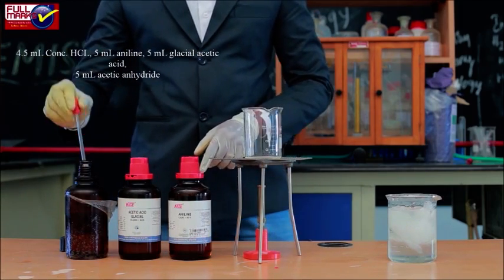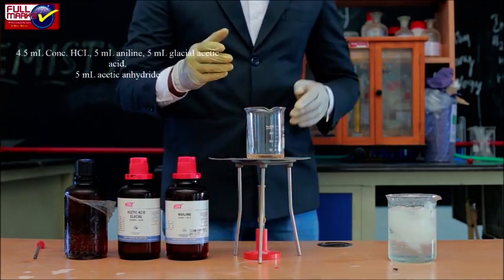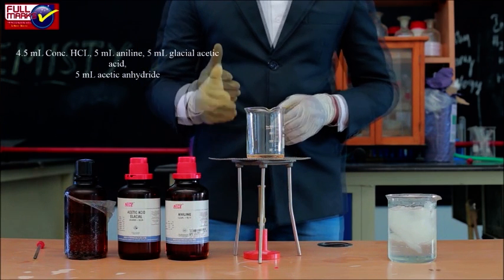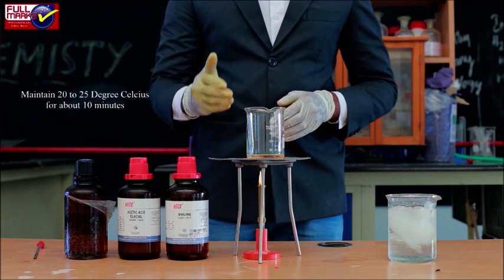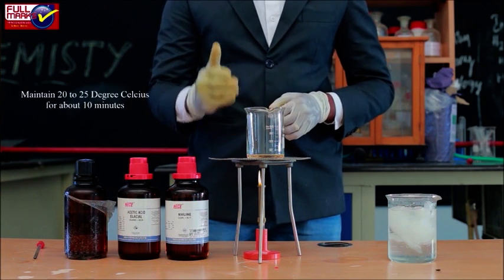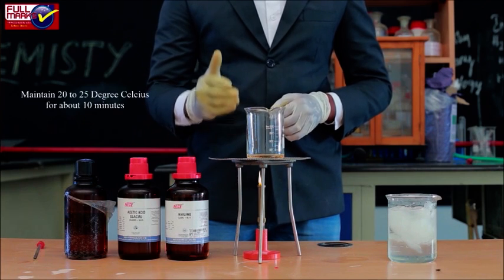Add 5 ml acetic anhydride into the aniline and HCl solution. Maintain the temperature of the flask between 20 to 25 degrees Celsius.